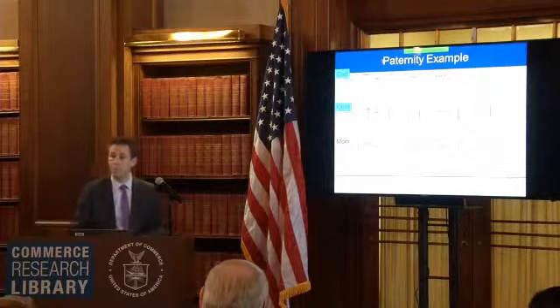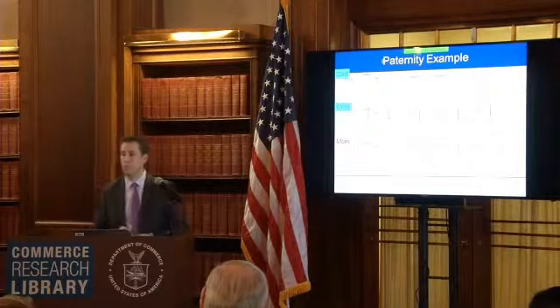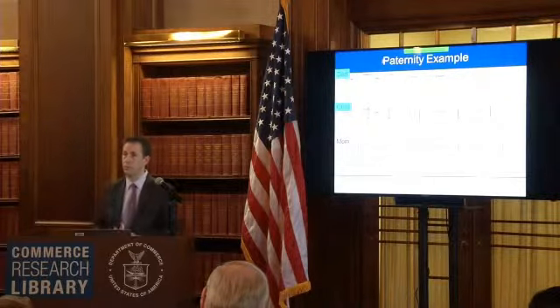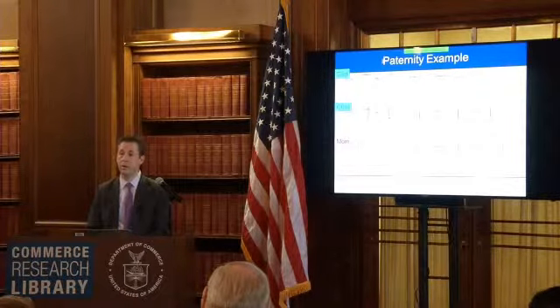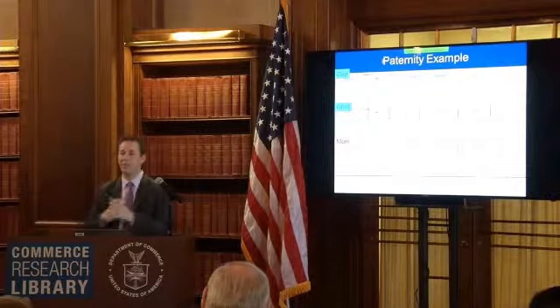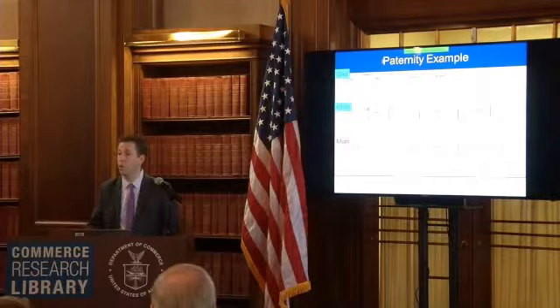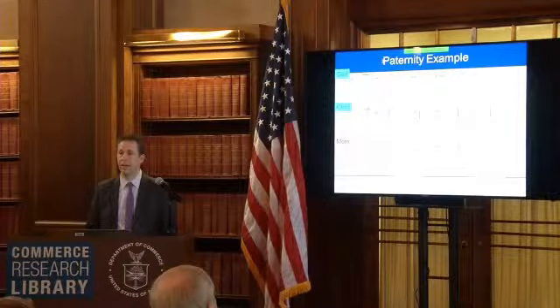So if two twins died, say in a car crash, one's name is Antoinette, one is Annie, can you tell which one is Annie and which one is Antoinette? If they're both the same sex and identical, I would say with this type of testing, no, it would not work. You'd have to go to more of a research genetic type of testing to do that. It wouldn't work with these commercial kits. Okay. Yeah. Oh, thank you.